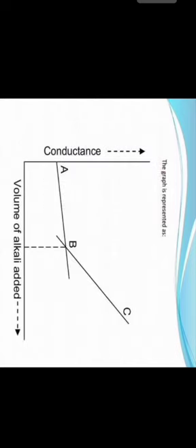The second is weak acid against strong base. For example, acetic acid against sodium hydroxide. Here, the conductance starts low because acetic acid is a weak electrolyte. As NaOH is added, weakly conducting acetic acid is neutralized and replaced by strongly conducting acetate ions and Na+. So conductance increases steadily, and more sharply after the equivalence point due to OH-. Here is the graph representation of this example.